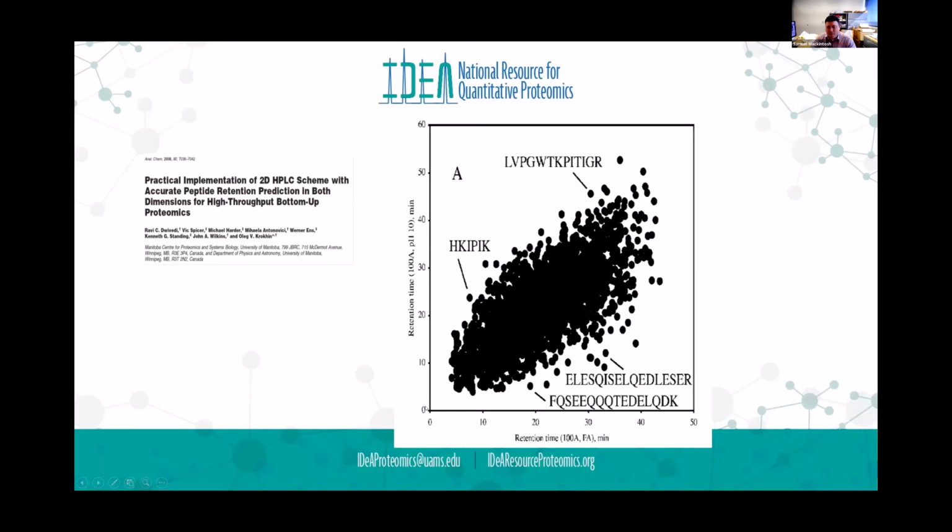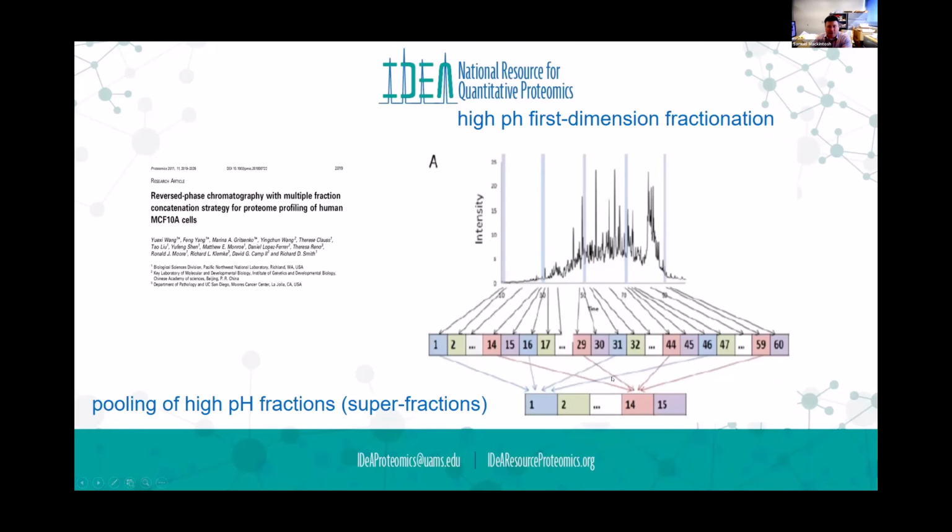Now, if this graph were a straight line from the origin, up along the diagonal here, then it wouldn't work at all. It might be closer to what you would intuitively expect. But just changing the pH for the reverse phase separation changes the interaction of most peptides enough that you can get a good separation. So I won't go into detail here.